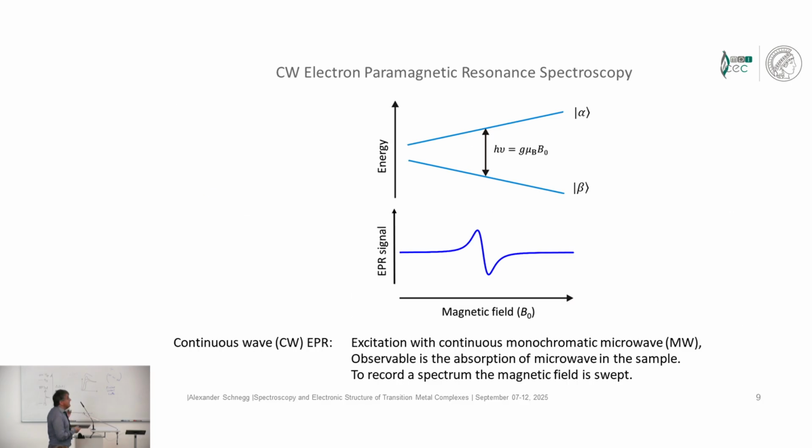Therefore, we have to resort to another technique, which is even the older one, and NMR has previously also been recorded by this technique.